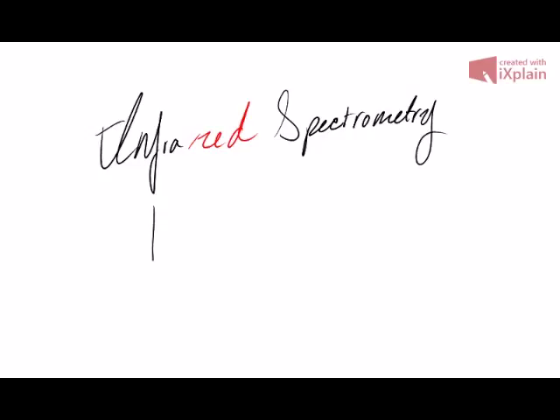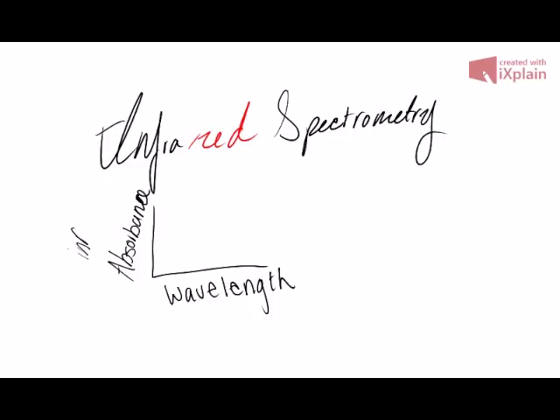Another experimental analysis that we performed on the benzyl acetate that we synthesized was infrared spectrometry. Infrared spectrometry analyzes the types of bonding present in the molecule by analyzing the stretching and bending and other types of movement that occurs on the molecules in relation to the various atoms within the molecule. The way this works is that a sample is run through the infrared spectrometer, and then it records the infrared light absorbance versus the wavelength. This is the absorbance that occurs at specific wavelengths based on the structures present in the molecule.